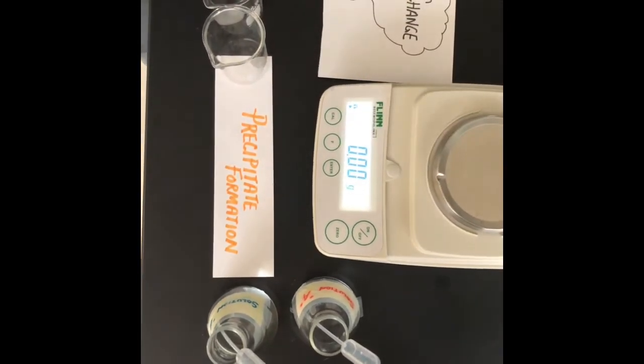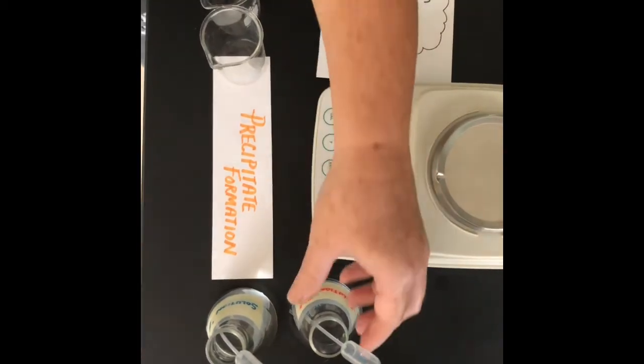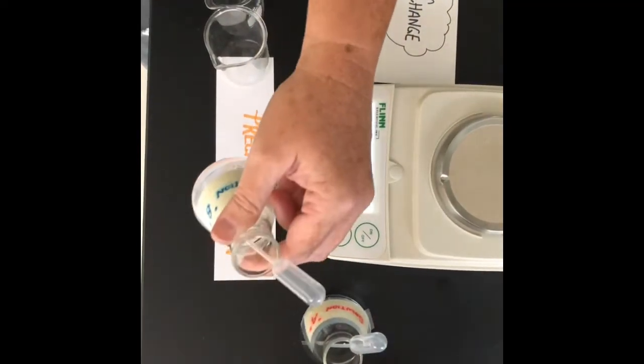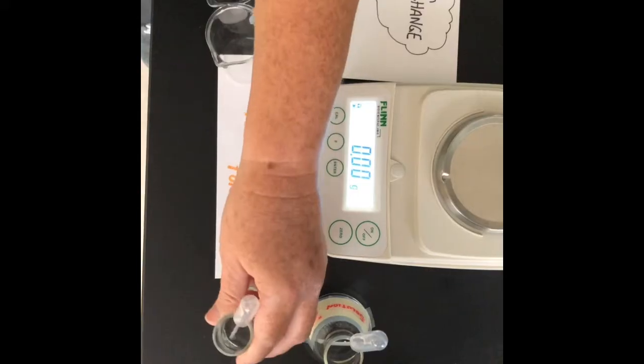This is our third mini lab. It is known as Precipitate formation. You will notice on screen that I have two empty beakers. I also have two flasks containing two different solutions. Solution A, notice it is colorless, looks like water. Solution B, also colorless, looks like water.